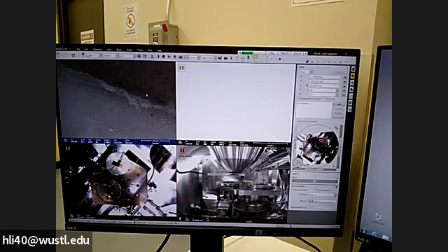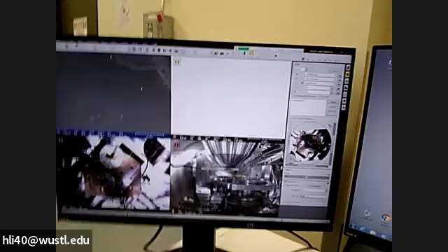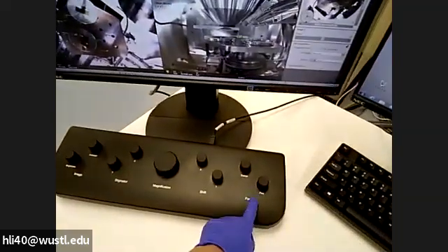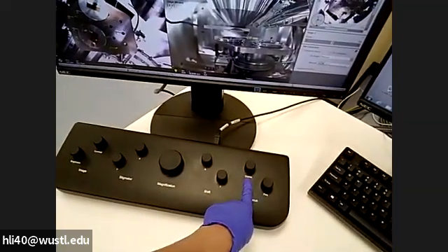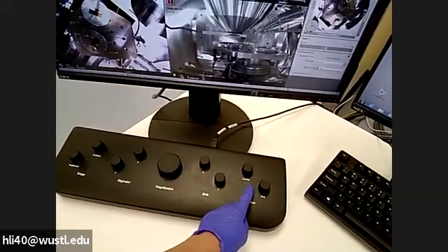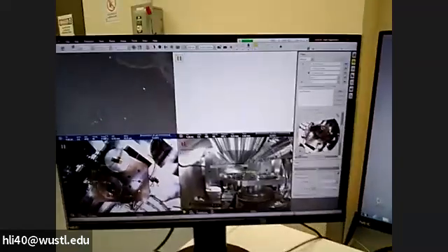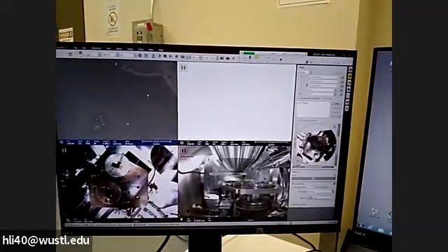So let's say change magnification to higher. Okay, we use a focus knob. For the focus knob, we do have two knobs there, fine and coarse. I would suggest never use the coarse. It's very coarse, really big step there. So we use the fine knob there.